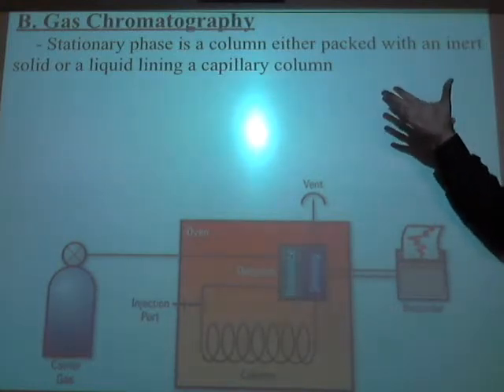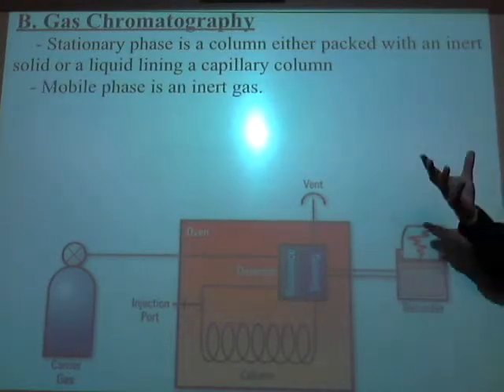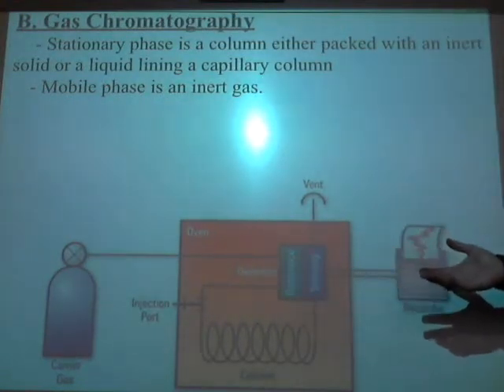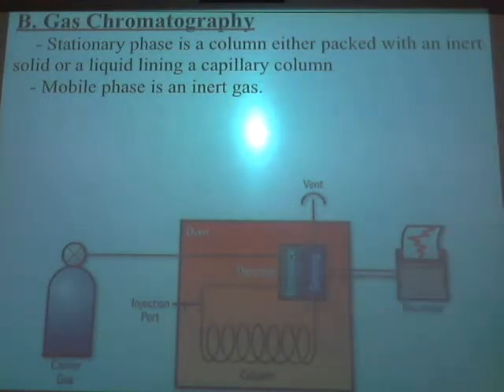All right. So the stationary phase is a column. The mobile phase is a gas, an inert gas. Why an inert gas? Why not use oxygen to push it through? What might a non-inert gas do? React with the stuff inside your thing and ruin everything. It will create new substances, new things that you shouldn't have had there. You're trying to separate something, not make something.